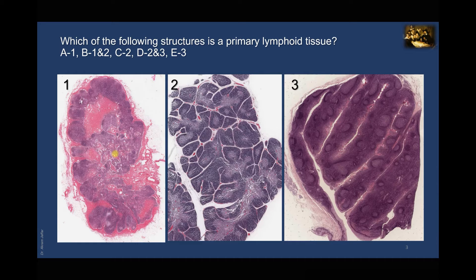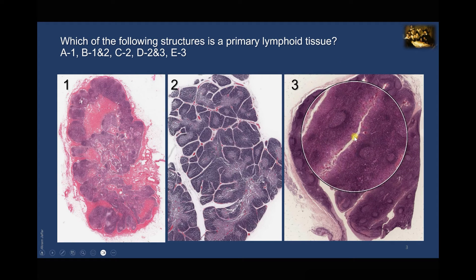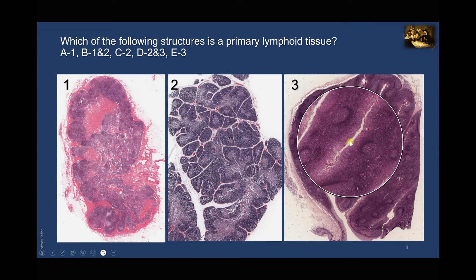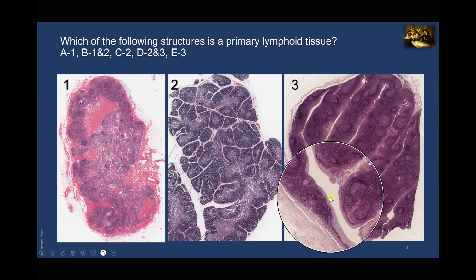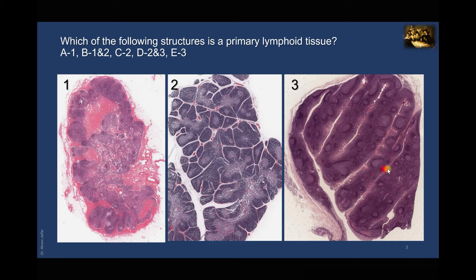A secondary lymphatic organ is not always surrounded by a capsule of connective tissue; sometimes it is non-encapsulated, like lymphatic nodules shown here in image three. These lymphatic nodules are located underneath the mucosa, hence they are called mucosa-associated lymphoid tissue or MALT. The section in image three shows lymphatic nodules with light-staining germinal centers, but the entire tissue is not surrounded by a connective tissue capsule. It is covered by non-keratinizing stratified squamous epithelium, and the aggregates show crypts, indicating the tissue is derived from tonsils in the pharynx. So image three is again a secondary lymphatic organ that is non-encapsulated.